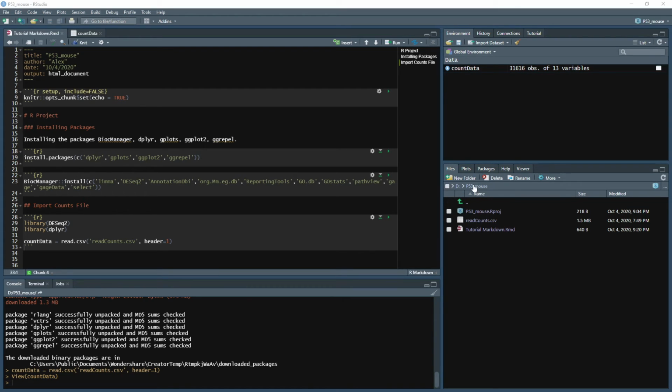And also, you can see here, P53 is the folder name that all of this is in. If you zip the P53 folder and everything inside, and give it to somebody else to look at, or upload the whole zip to GitHub, barring a massive file size, somebody can then download that same folder and double click on the project file inside of that folder once they extract everything, and they'll be able to do exactly the same thing that you are, as long as they have all of these installed. So it keeps everything really, really clean.